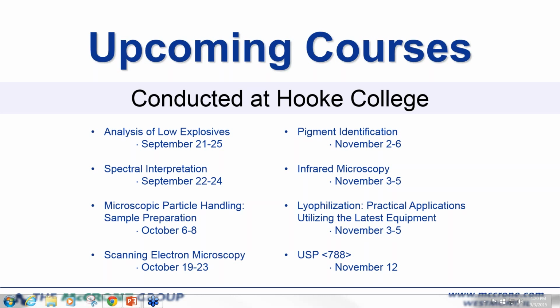In terms of a viscous liquid, you want to do your best to match and make sure you get a very good quality spectrum so that some subtleties in the spectra can also be matched up, and you need to make sure that your library covers all of those possibilities that you might be interested in. And sometimes, of course, you want to employ other techniques. You might want to do a pyrolysis measurement, pyrolysis IR, pyrolysis GC, HPLC, or something like that, or some other mass spectrometry.